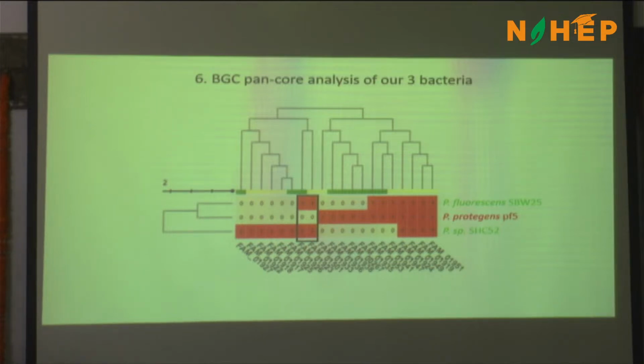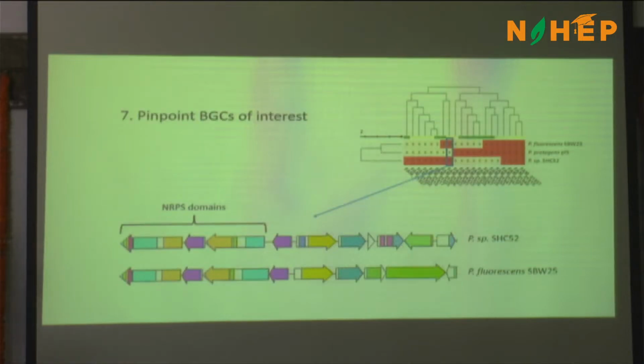So we did the analysis at the gene level, we checked the genes, we saw the category of secondary metabolites pop up, then we moved to this framework that is more focused and more specialized in secondary metabolites, and we found these 2. So if we want to check in more detail what these BGCs do, we took one of them and we aligned them and we see this.